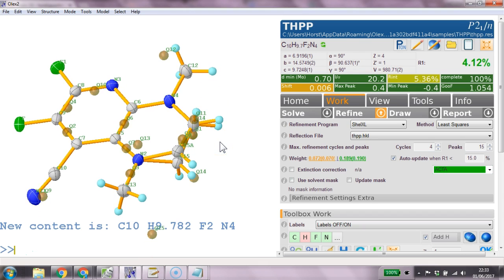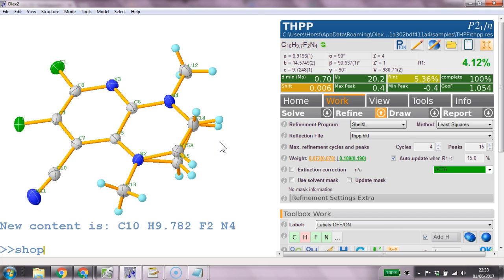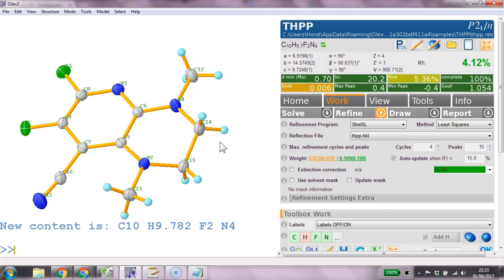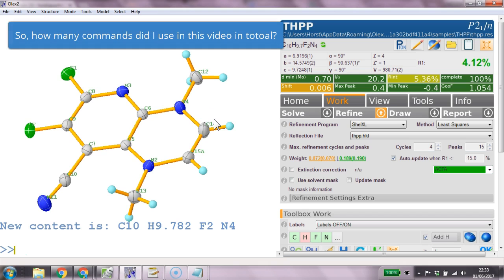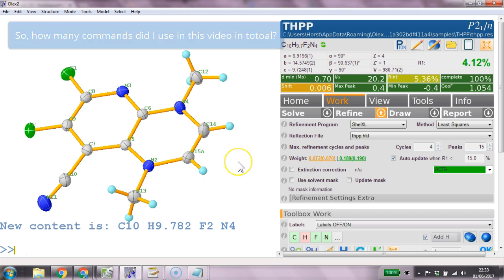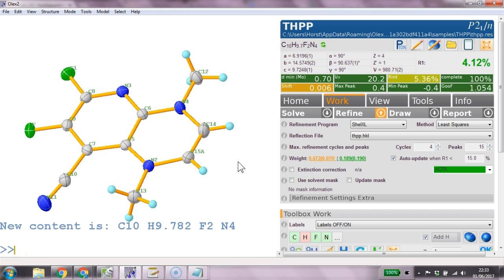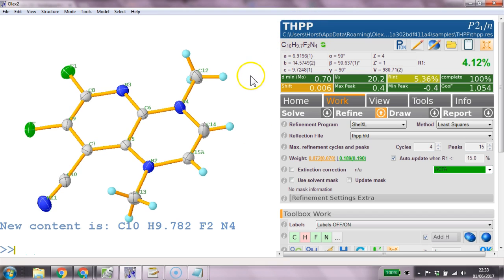That we can go ctrl q to hide those q peaks. You can go show part show p 0 and 1. So that shows us part 0 and part 1. So this is a ch2 and ch2. Or we can go show p 0 and 2. And that's the other one which is the unsaturated starting material at 13%. And that's why the overall formula unit isn't integral.